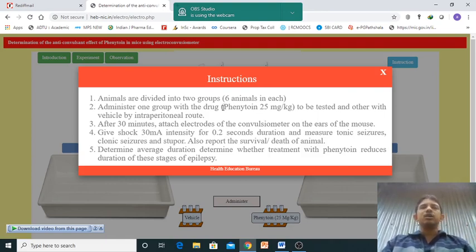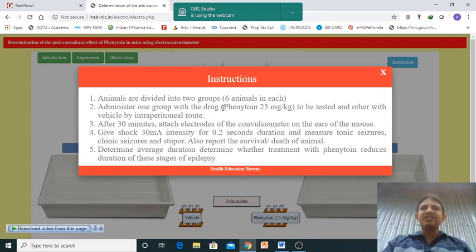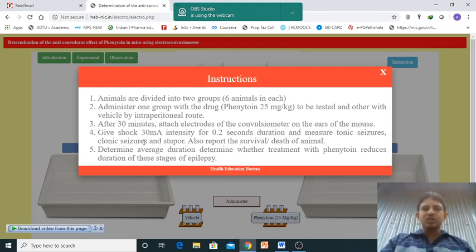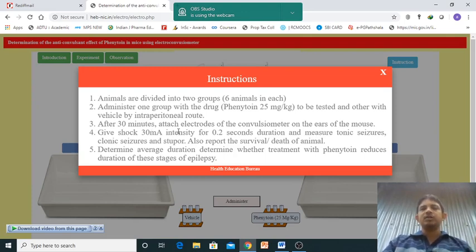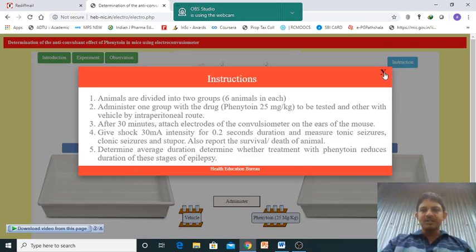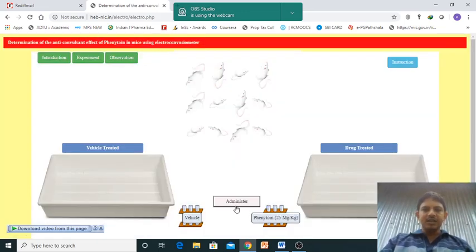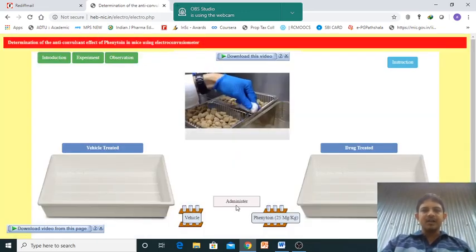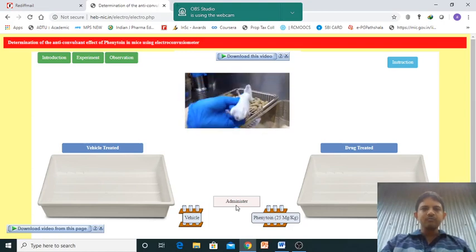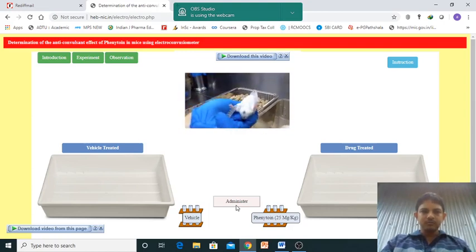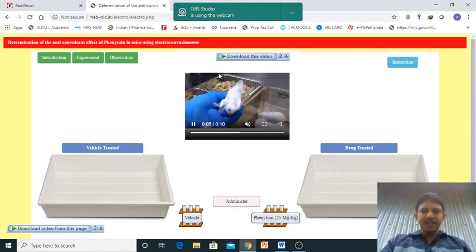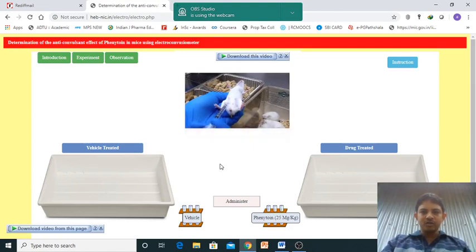The shocks will be given at 30 milliampere, though these ranges vary experiment to experiment, for two seconds. Now we will give the administration of the drug. Again, intraperitoneal route - drug was given.